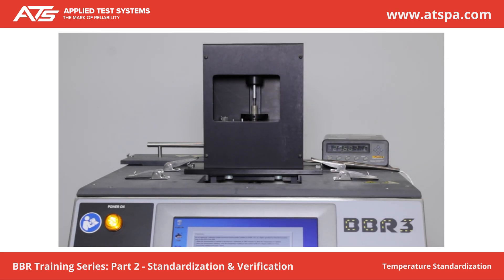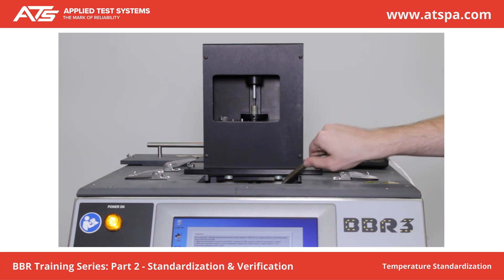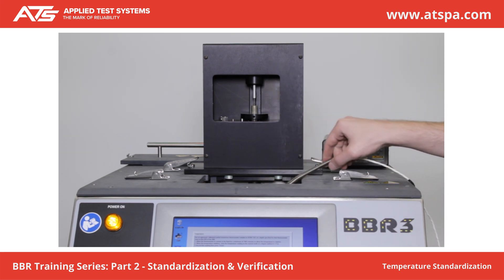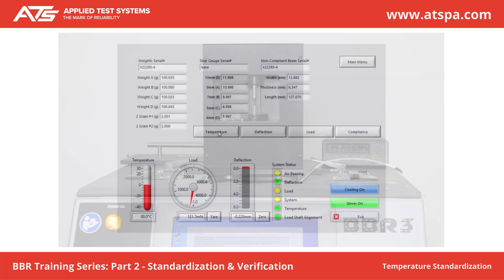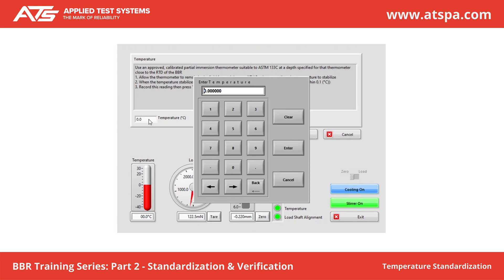Use an approved, calibrated partial immersion thermometer suitable to ASTM-133C at a depth specified for that thermometer, close to the RTD of the BBR. Allow the thermometer to remain in the fluid for a minimum of two minutes to allow the temperature to stabilize. When the temperature stabilizes, note the temperature reading to the nearest tenth of a degree, record this reading, and press Finish.